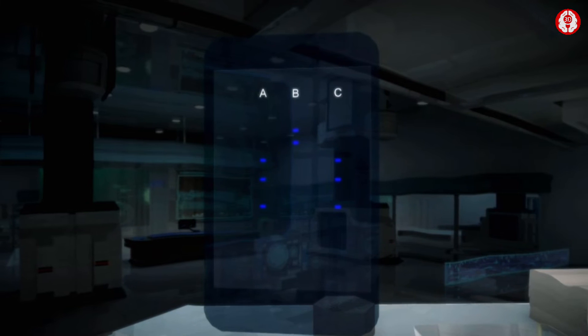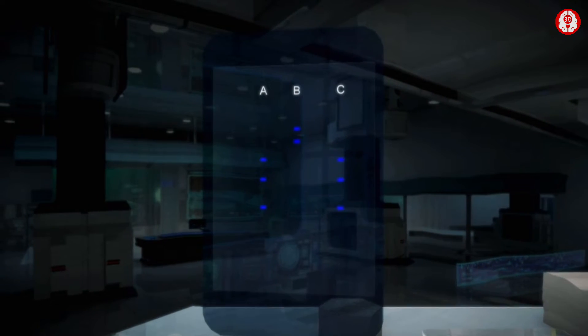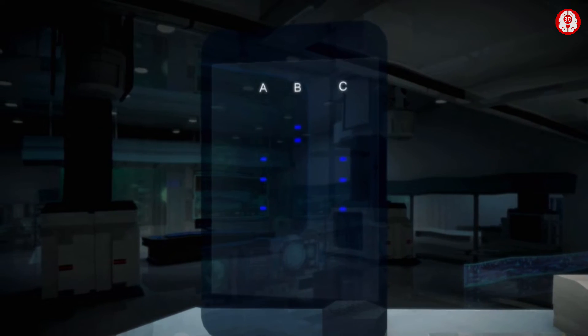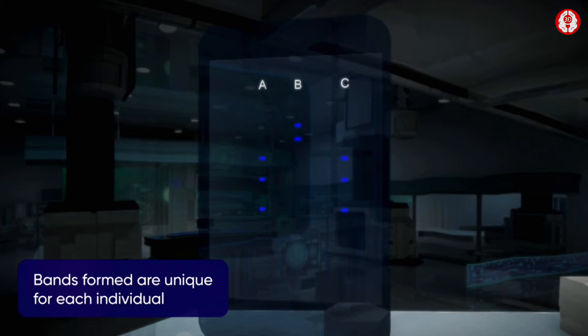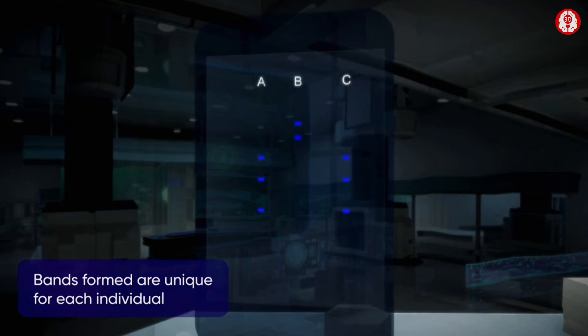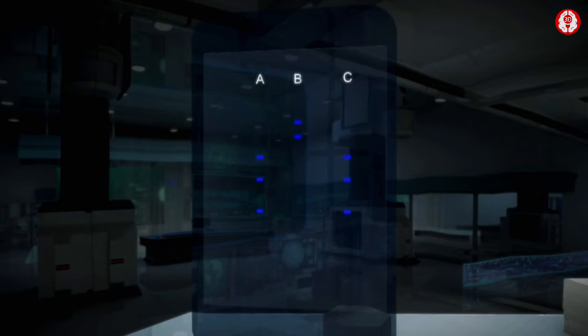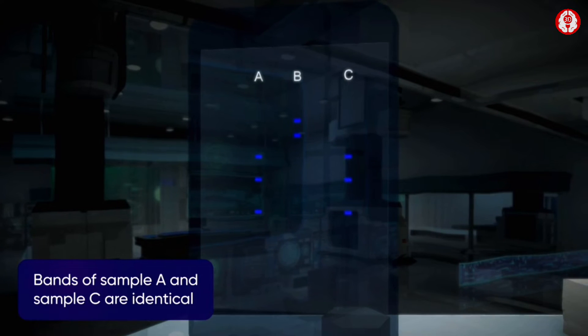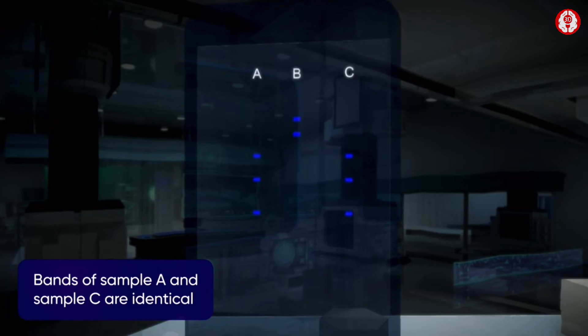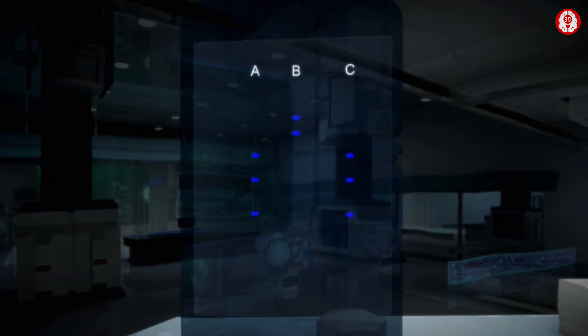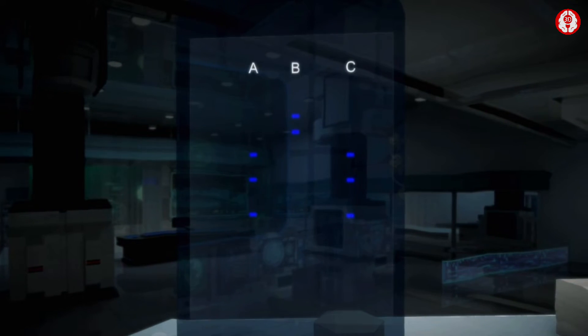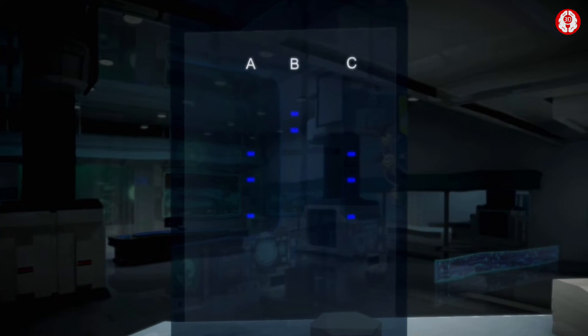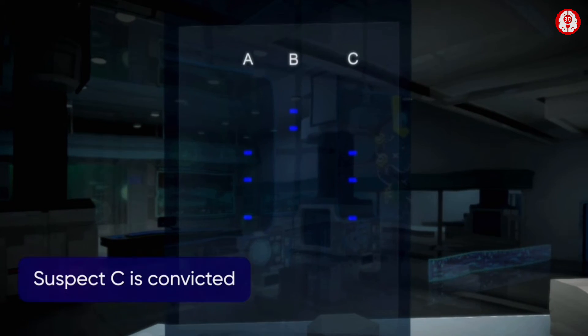Since the enzymes cut the DNA into a unique combination of lengths, the bands formed will be distinct for different individuals. But here we find that the bands for sample A and sample C are the same. This shows that DNA samples A and C are from the same individual and the suspect is identified.